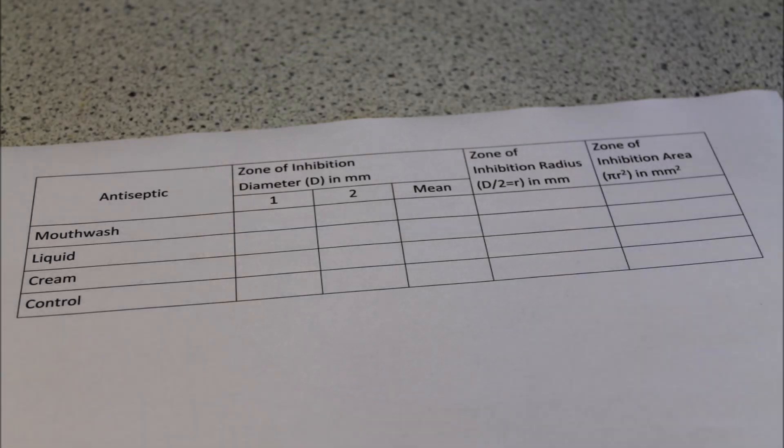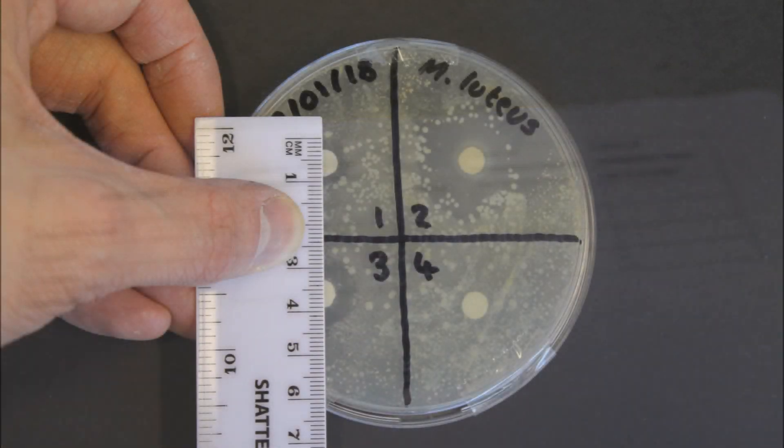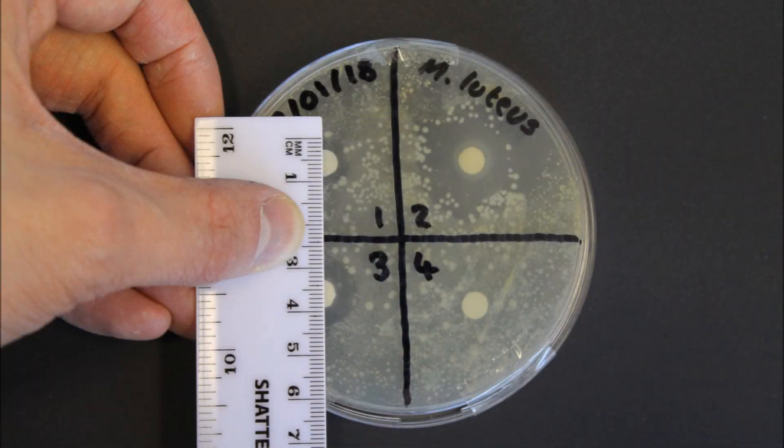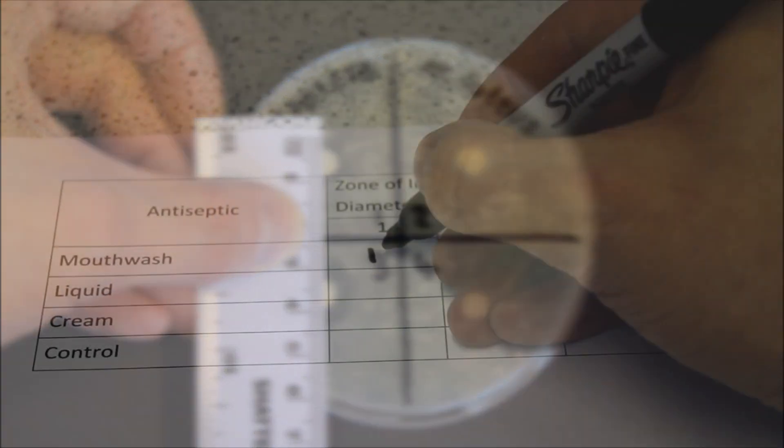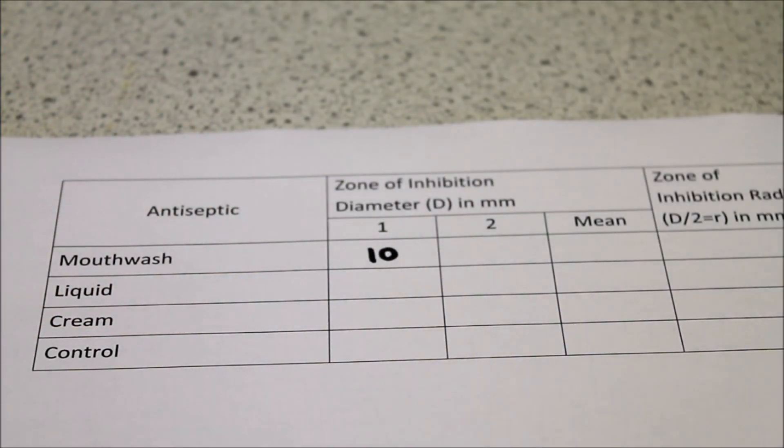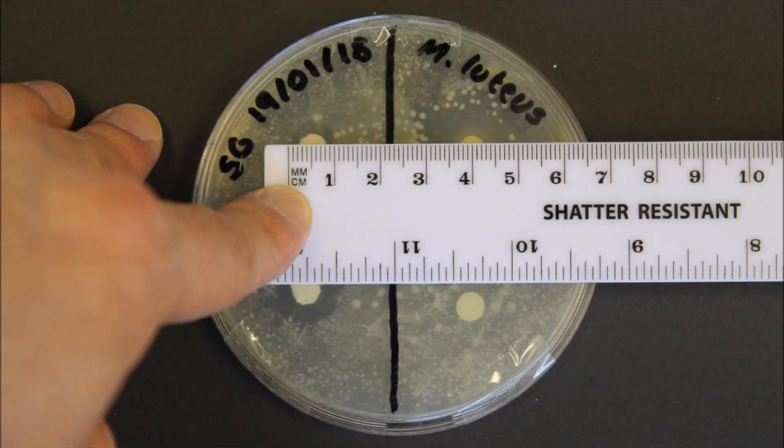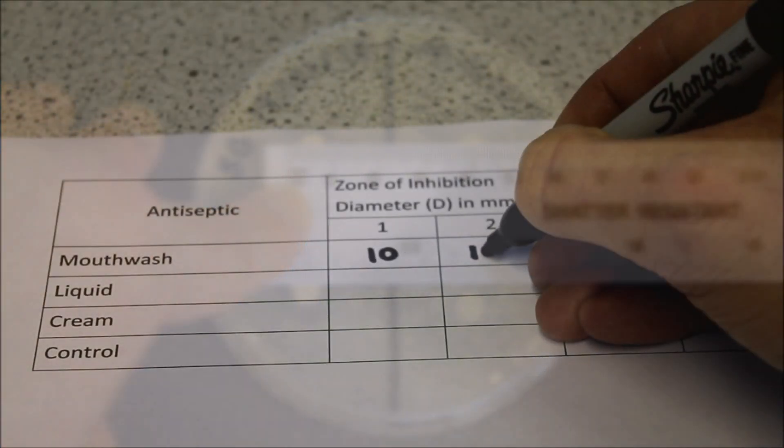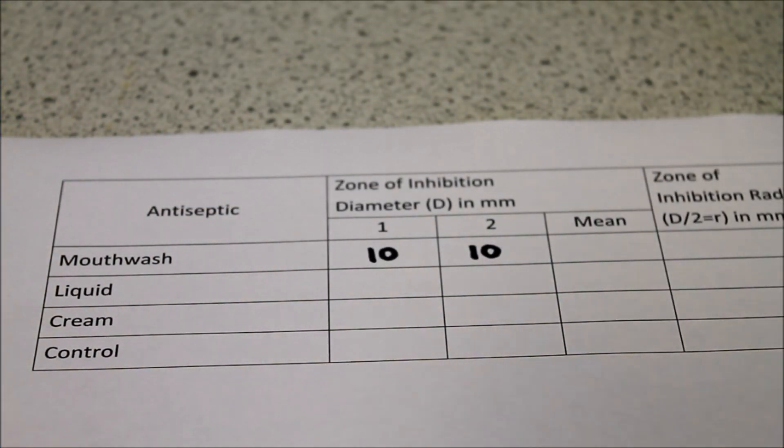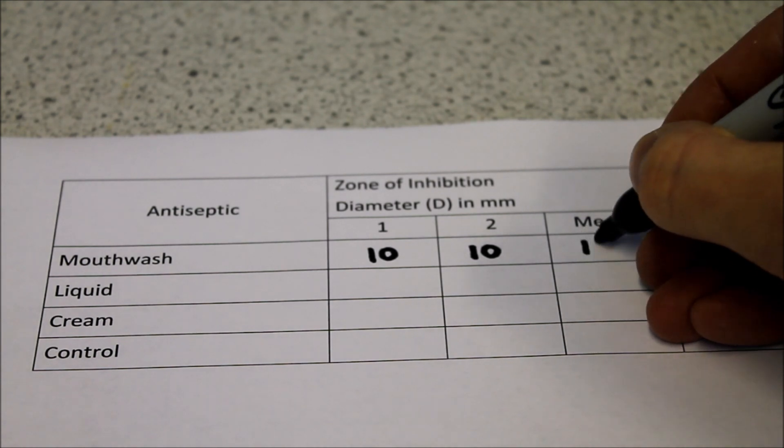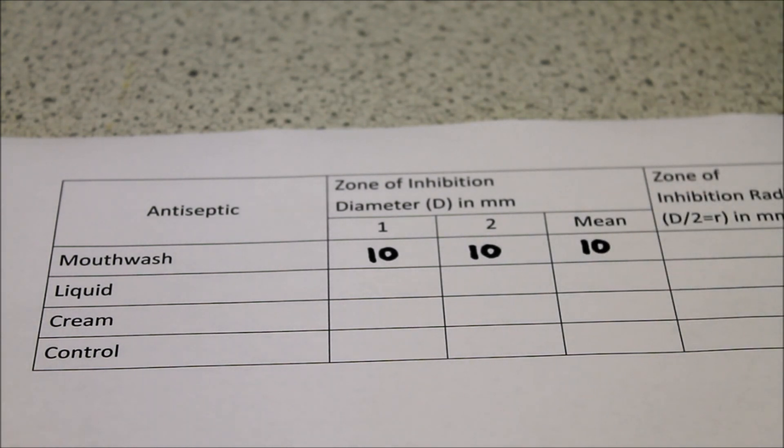You will now need to draw a results table similar to this. For each antiseptic disc use a ruler to measure the diameter of the zone of inhibition. Here it is 10 millimeters. The diameter will need to be measured a second time at 90 degrees to the first because zones of inhibition are not always circular. However here it is 10 millimeters again. The mean average diameter can now be calculated and in this case it's the same.